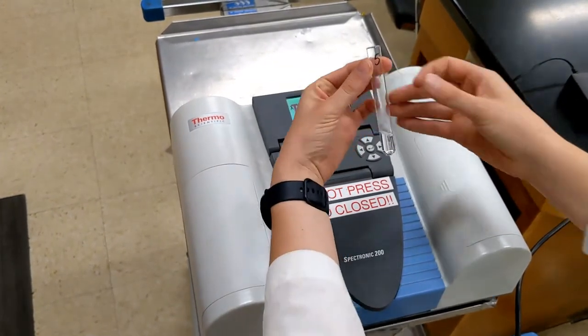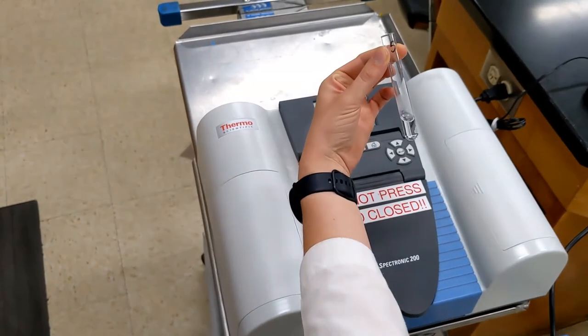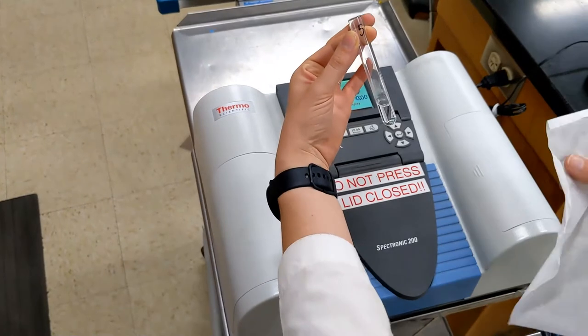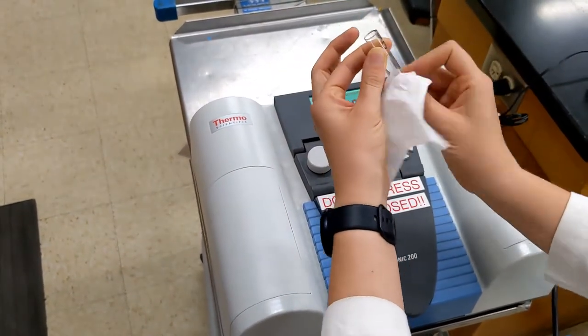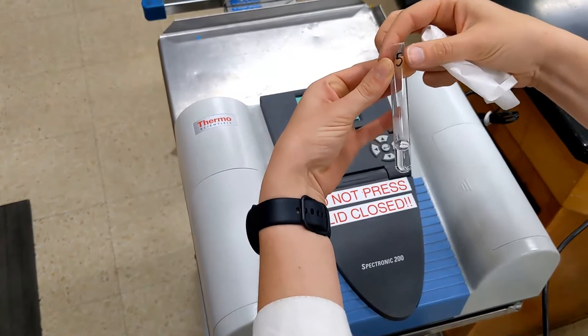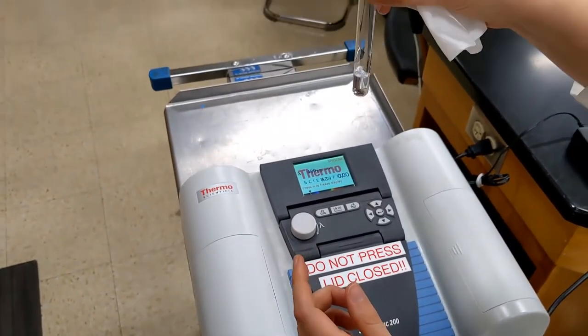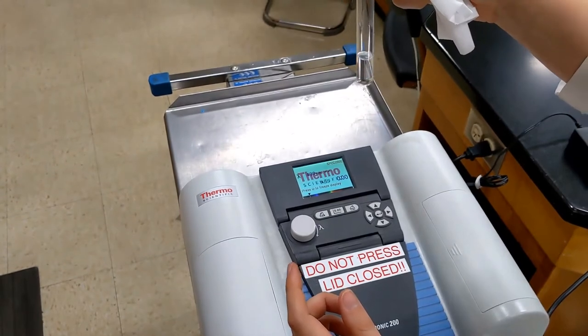First, you need to wipe down this glass, because any smudges will mess up your results. I'm also making sure there aren't any noticeable bubbles in the tube that could interfere with my reading.